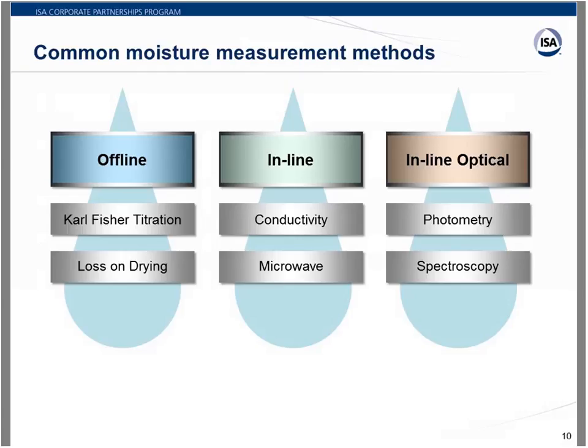Initially, you'll get the reaction with the Karl Fischer reagent of the water in the material. But then if it's a high level of water, there will be water out on the vessel walls like I just spoke of before, and that will introduce drift into the measurement as the reagent scavenges the last bits of water off the walls.